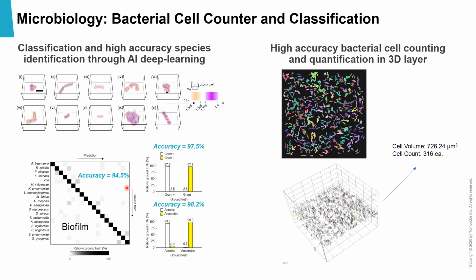This is important for cases of sepsis, for example, where toxins from bacteria can incur septic shock to a patient. If a patient has been diagnosed, time is the most important factor to identify which bacteria is in the blood. From my understanding, the time it takes for current tests to get results is about a day or two, and a person could die in that time if they are not treated. Our bacterial cell counter differs from other commercial cell counters because we can image in 3D and tell if the bacteria is at the top or bottom of various layers of biofilm, leading to more accurate analysis.